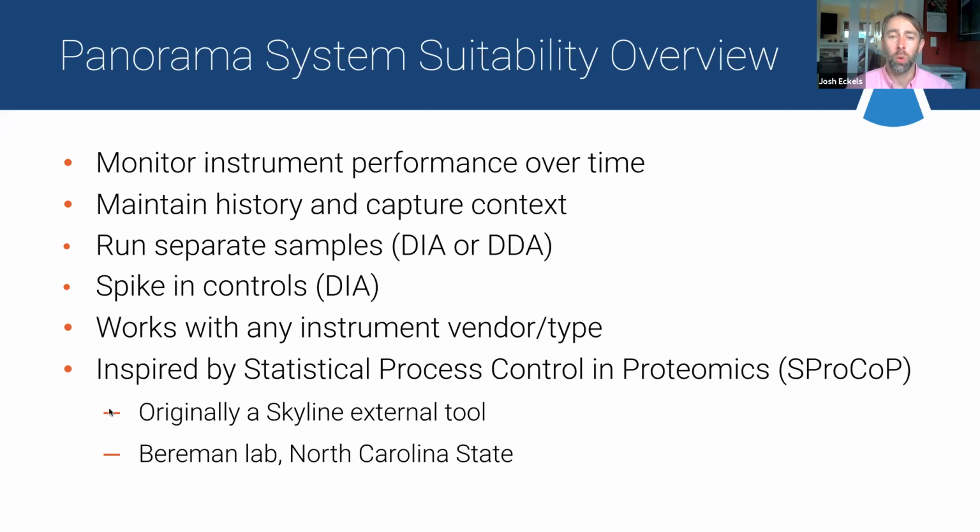And then I also wanted to call out that all of what we've done on the Panorama side has really been inspired by a Skyline external tool called SProCoP, Statistical Process Control in Proteomics. In particular, thanks to Michael Bereman, who I'm sad to say passed away earlier this year. I really want to thank him and his whole team at North Carolina State for paving a path on this and being great collaborators in helping us make it more automated and roll it out to an even wider audience.